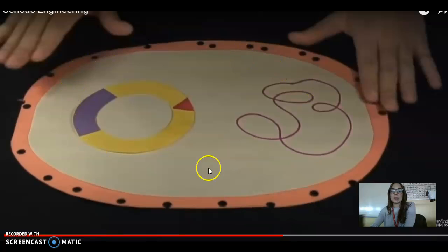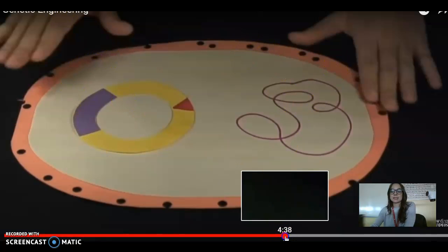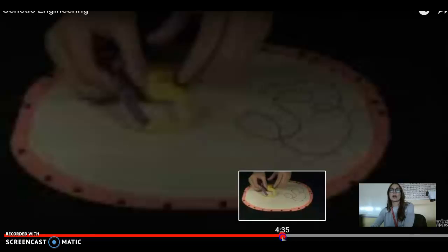So I heat up a bunch of the bacteria. They get holes in them. I mix it with the plasmids. Plasmids sneak in, and then the holes close back up because I cool it back down. So there are now four things that could happen.